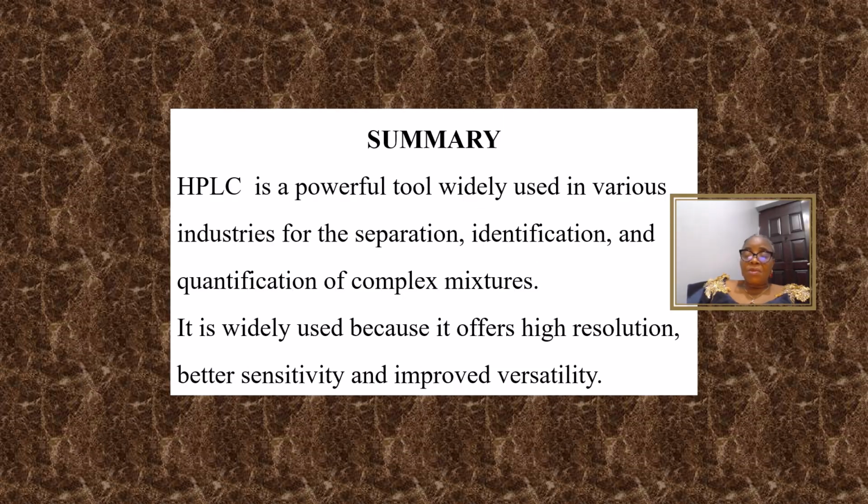Well, the summary. HPLC is a powerful tool widely used in various industries for the separation, identification, and quantification of complex mixtures. It is widely used because it offers high resolution, better sensitivity, and improved versatility.